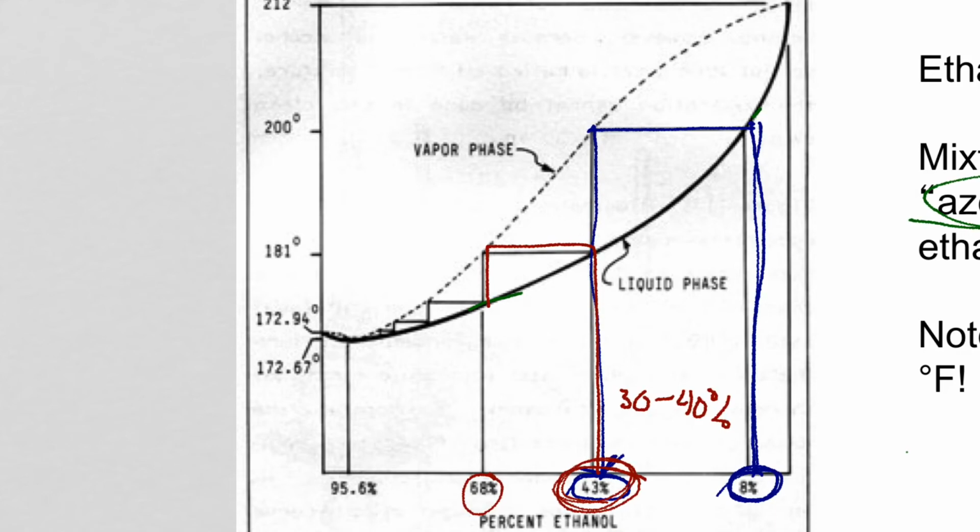Because we're going to add in an extra piece, which is called a Vigreux column, we've got additional theoretical plates. So we can have another vaporization condensation step and another, and these get smaller and smaller until ideally we'd get to our maximum, which is about a 95% ethanol solution. And so that's what we're shooting for in this lab.